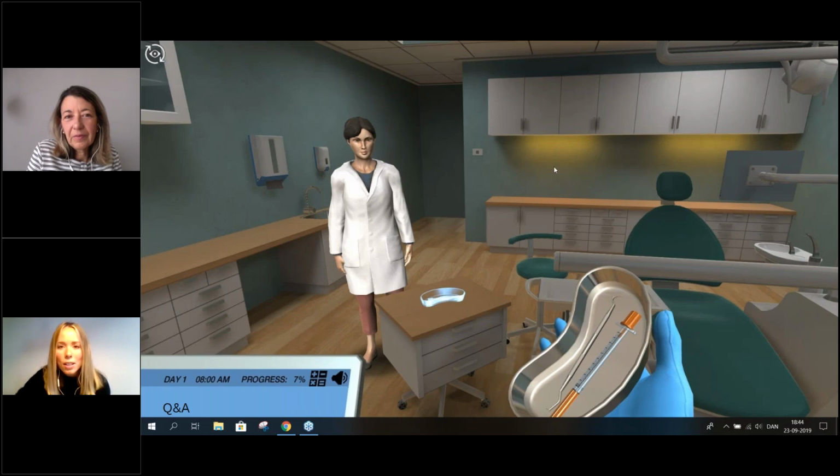Oh, let me see. I got one more question here. I think the attire of people in the exercises needs to be more compliant with safety rules. In the current image, the woman wears slippers and the trousers are not at full length. That's a great point as well. This is actually not a lab. This is, I guess, a clinic or something, but it's part of the introductory scene of the simulation. But it's a great point. And again, I'm not the microbiology expert. I don't actually know what the safety rules are, but it's a great point.